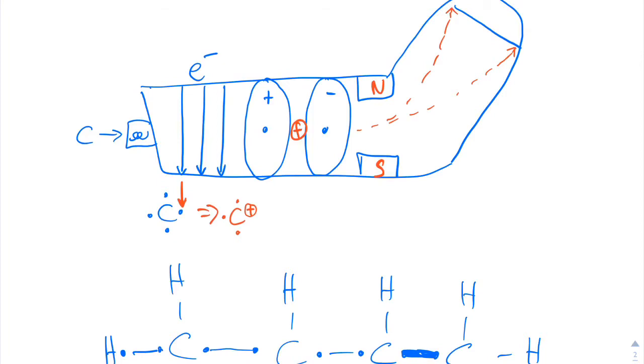I drew this ahead of time to speed this video along a little bit for you guys, but you should recognize this. I just want to walk you through the steps real quick again. Remember that the first step right here was vaporization. You had to take a chemical and get it into its gas state so that it would be free to separate and move throughout the instrument. A solid's not going to travel through this very easily. So our first step was to vaporize it.